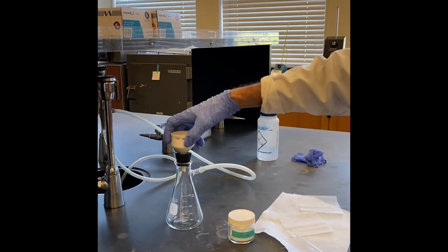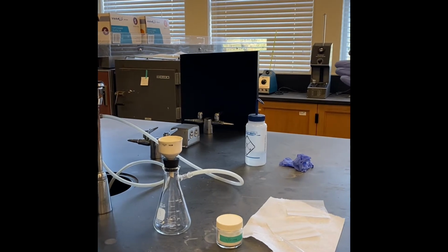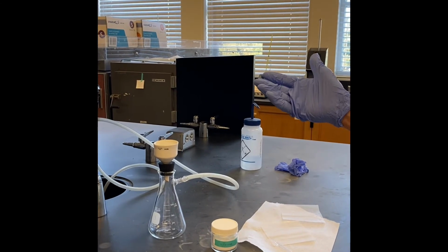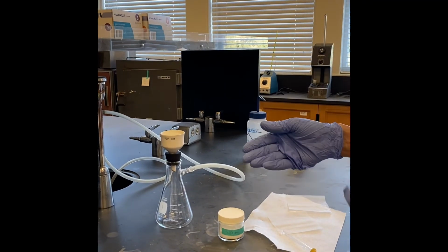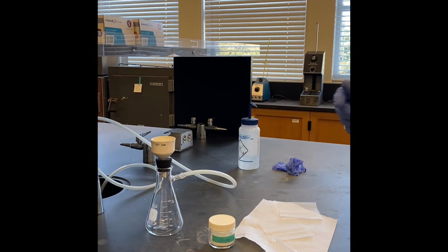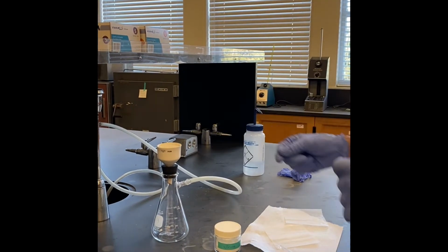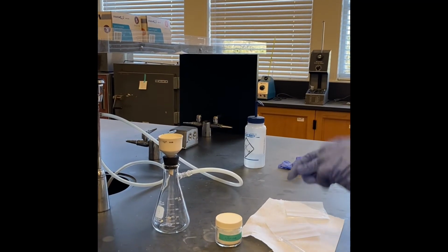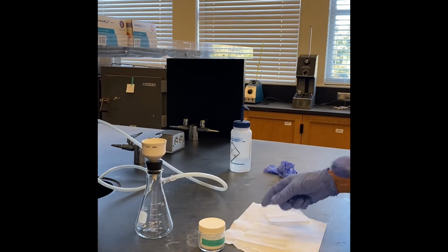Why am I not really filtering this? Because then I would have to wash this and we are closed because of COVID, and we don't have the facility or time to wash all those things. So what we do in the next step, we take those crystals and dump them here on a filter paper, then you transfer that into this paper, collect it, take a melting point. I will come back again.